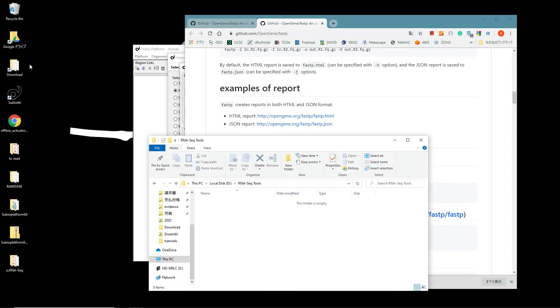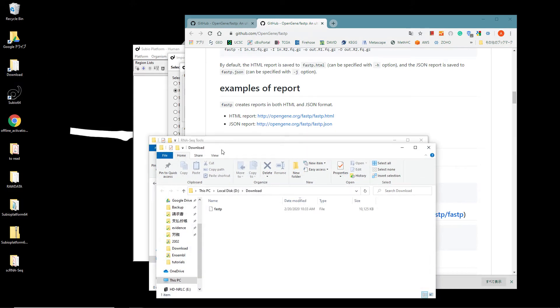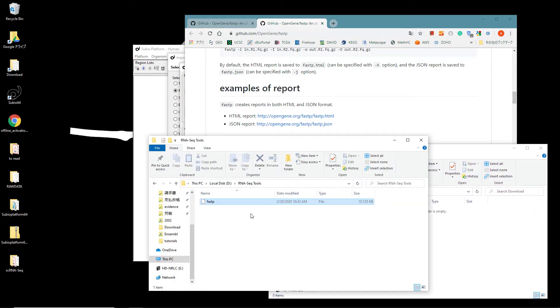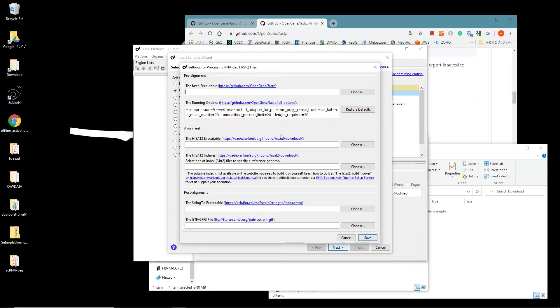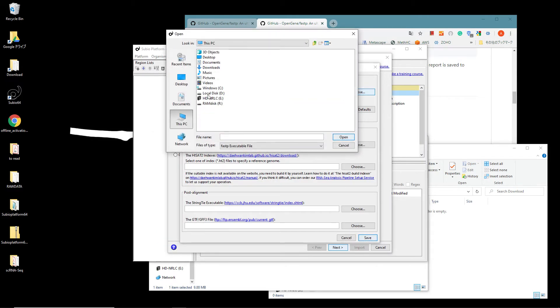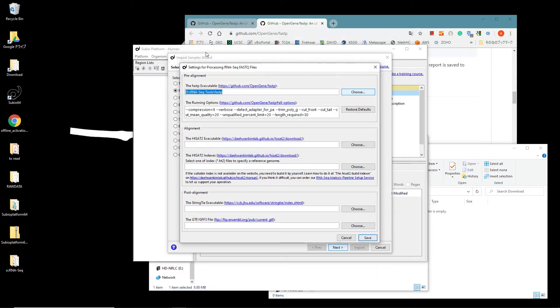Put the FASTP binary file in the folder. Go back to the Subio Platform's setting panel. Click the Choose button at the FASTP executable section and select the file.